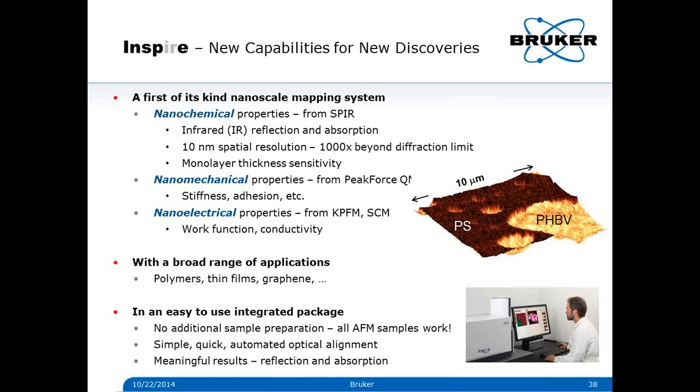Right, and so it can be the same metallic probe as for the scattering SNOM. For the scattering SNOM, yeah. That's the requirement for the SNOM tips, that you have a tip that is metallized. But it can be nicely combined with the other requirements, for example, for the nanoelectrical measurements, that needs a tip that is metallized.